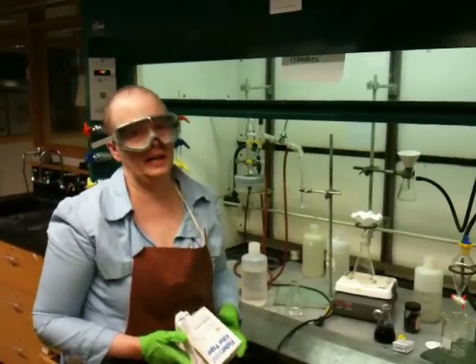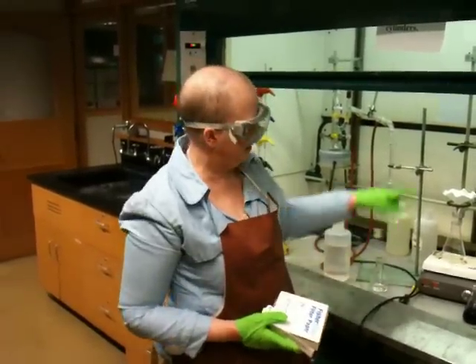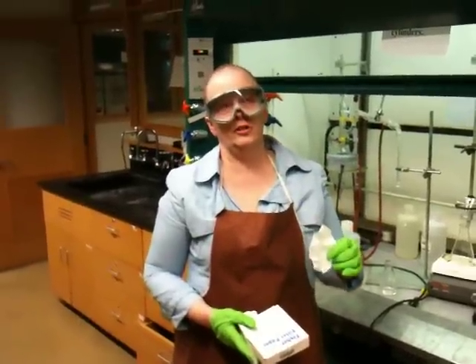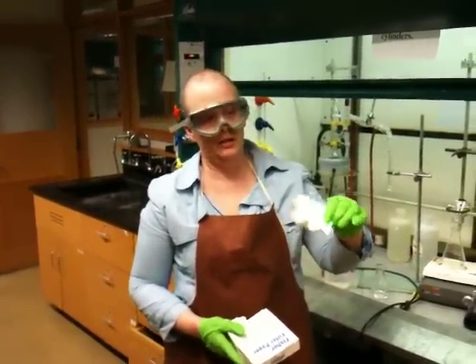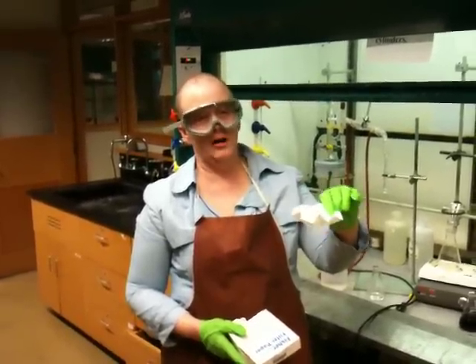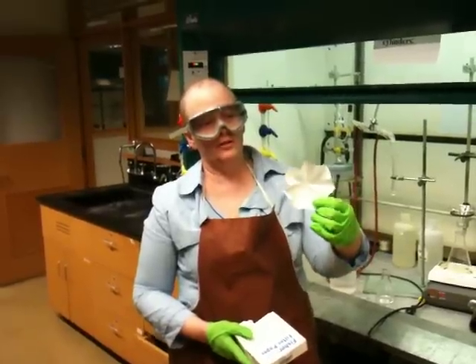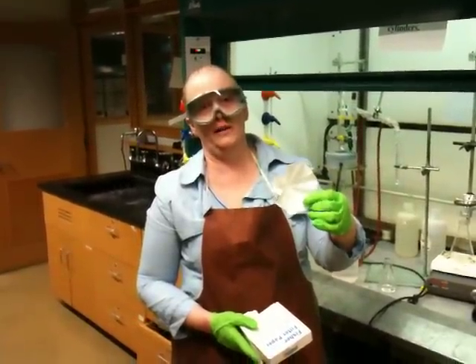Hi, this is Dr. Noorz in our organic chemistry lab at Bremer College. What I want to show you today is how to make a piece of fluted filter paper like this. When you want to filter an insoluble substance out of a hot solution, you normally will do what's called a fast filtration or a hot gravity filtration, and you'll want to filter through a paper that's highly fluted like this so that you get more surface area.